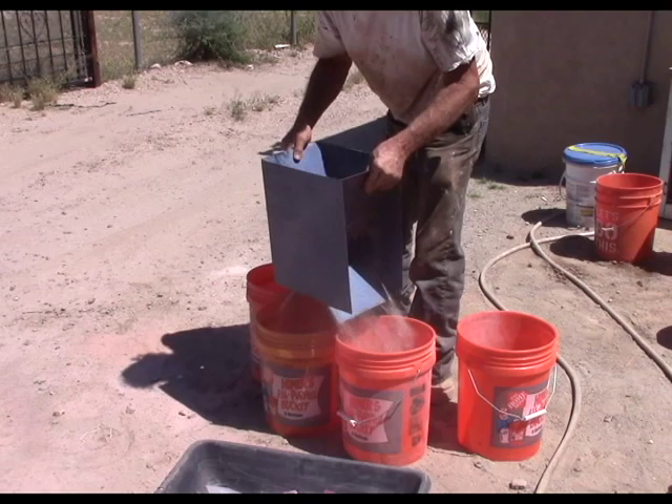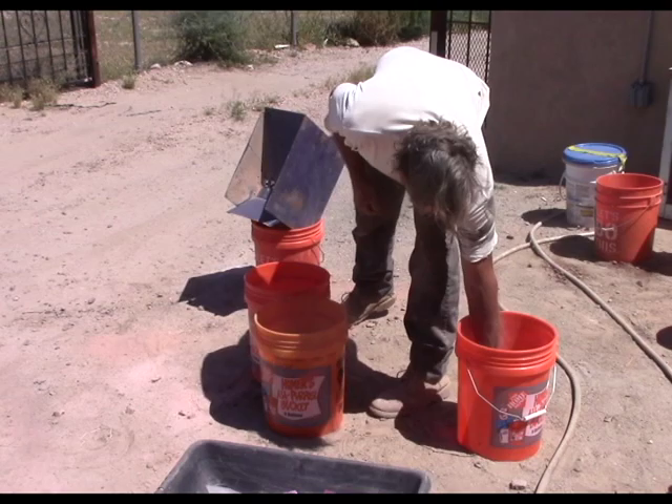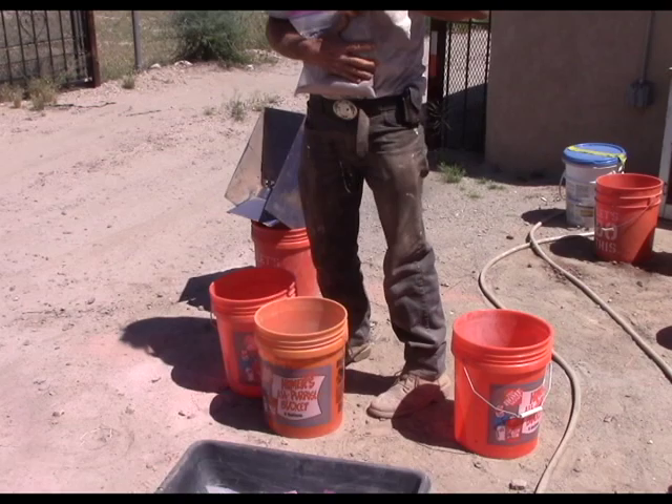And one last time, set that for your next sample, get the bag out of the bucket — it's just there to do nothing but hold bags — put it in the sample bag, and you're done.